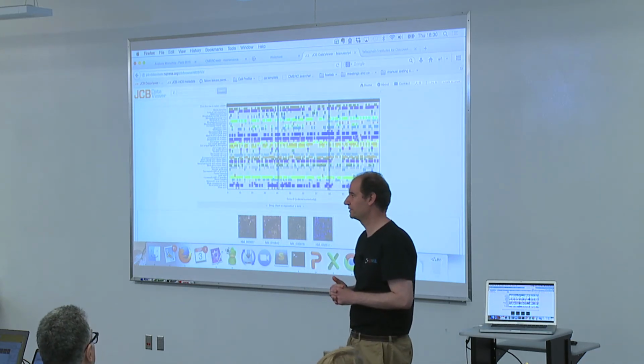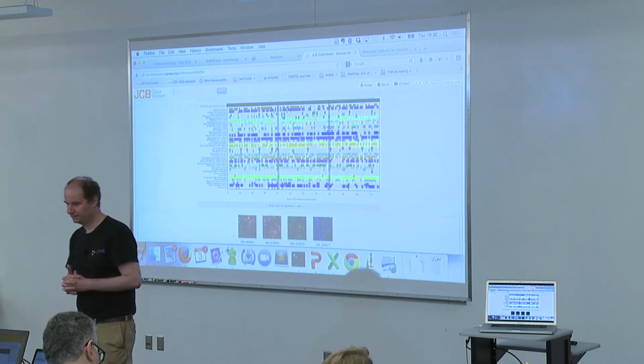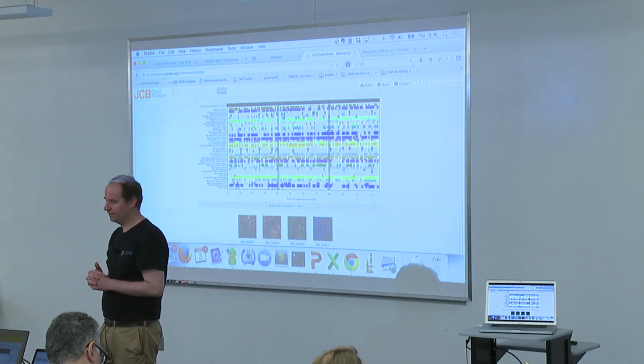Any more questions? Yes, please. You mentioned earlier about a C++ version of the file format. Yes, yes.